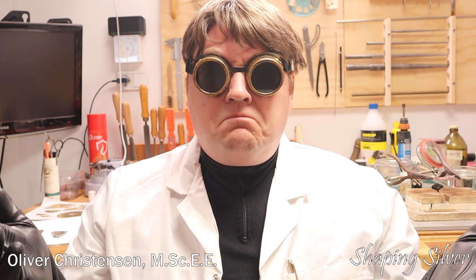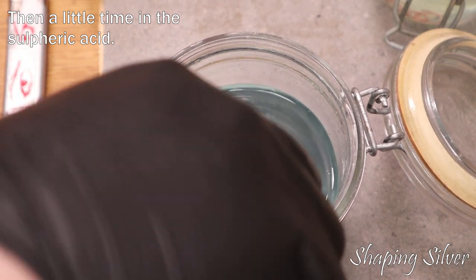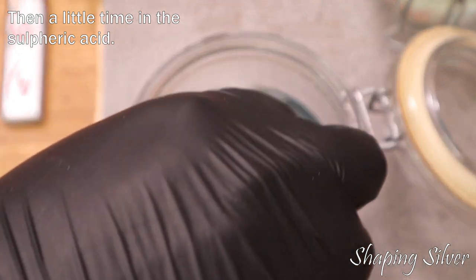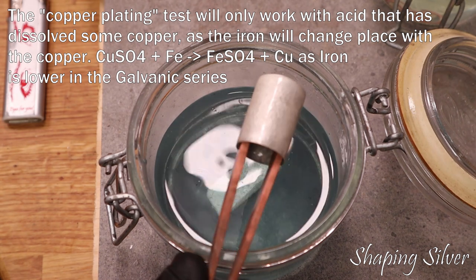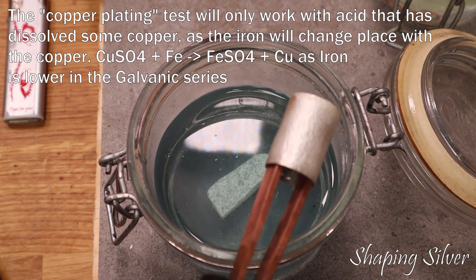With all the home tests out of the way, let's science things up a bit. We can try pickling the sample in sulfuric acid. This will rule out iron contamination, and zinc, nickel, aluminum, and copper alloys, which will dissolve while giving off bubbles or exposing pink copper.